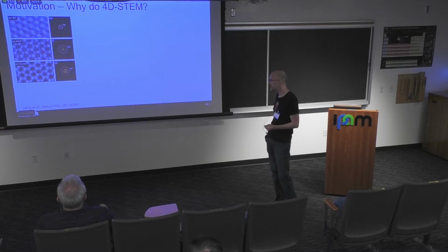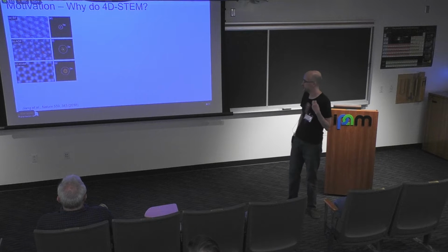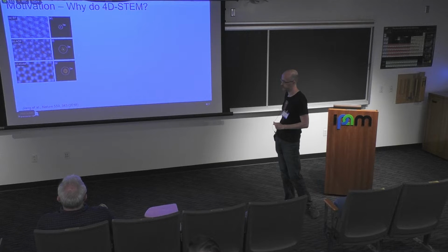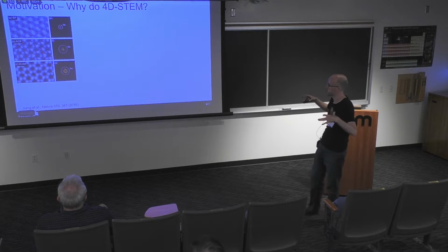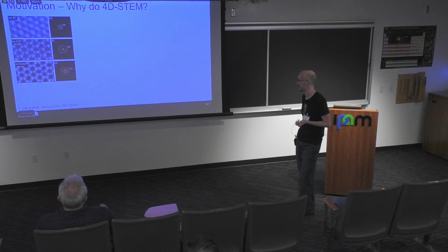If you switch to a phase contrast method, in this case center of mass differential phase contrast, you really boost the signal to noise by quite a bit, but you don't boost the resolution. If you look at the Fourier transform on the right-hand side, you can see that the maximum scattering angles that we resolve are twice the numerical aperture, twice alpha, of this experiment.